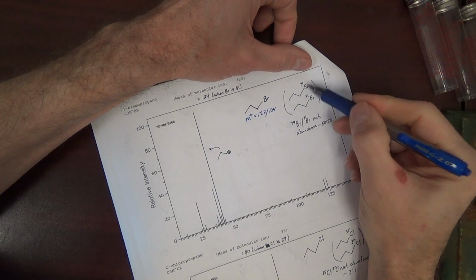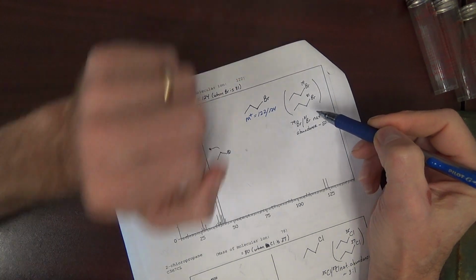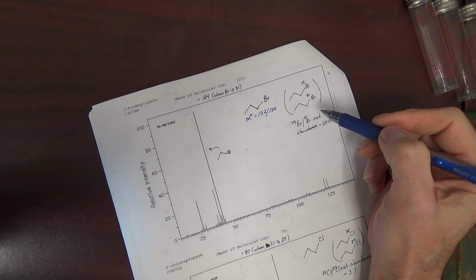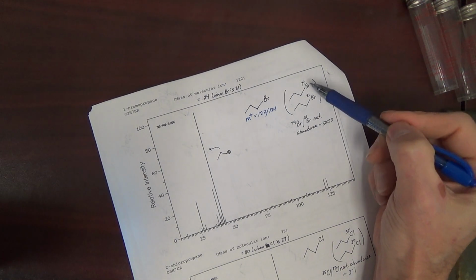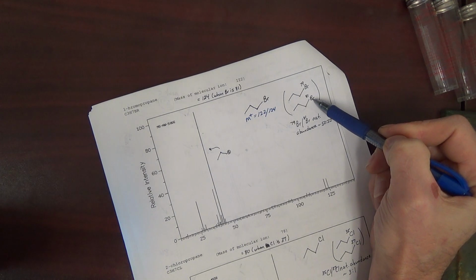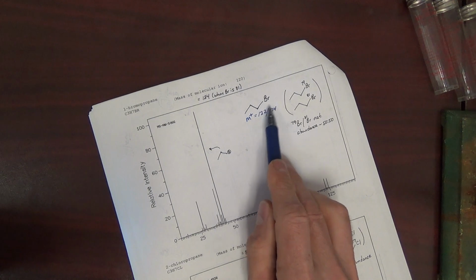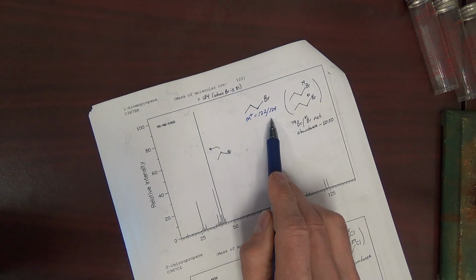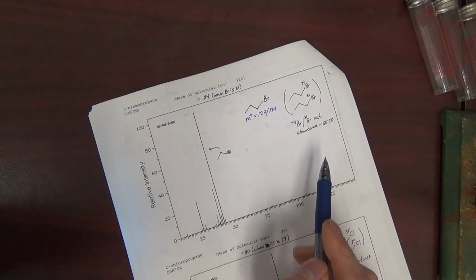Now, if you look on the periodic table, the mass of bromine will be like 79.9. We don't use that mass because that's an average mass. That's an average of all isotopes. Whenever we do mass spec, we see individual molecules. So we're going to see both this molecule and this molecule, either 122 or 124. We will never see a peak at 123, at least not as a result of anything with the bromine.